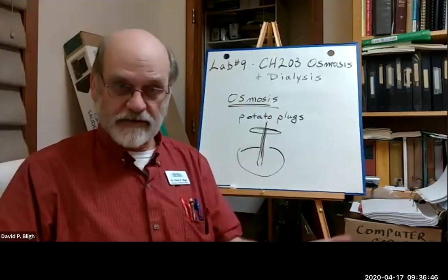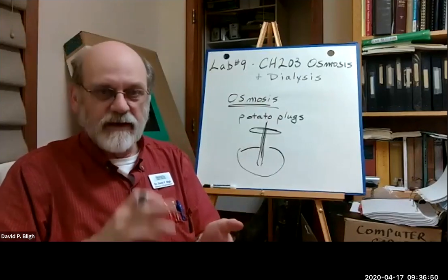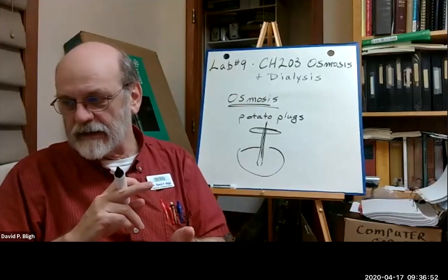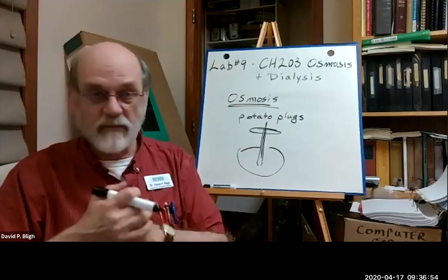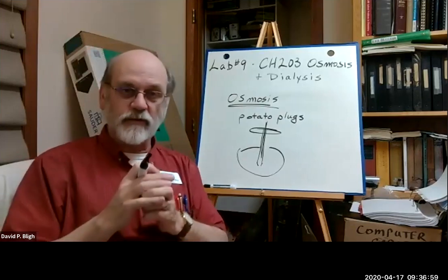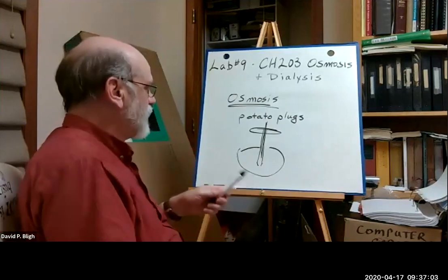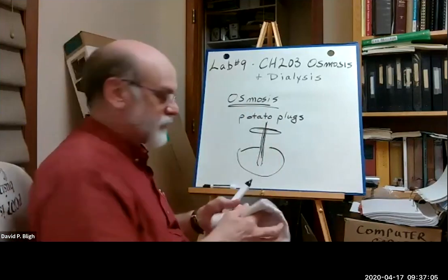And then you take the same types of measurements. Do the mass, do the length, and compare them with the original results, and draw some conclusions. That's what the post-lab questions are about. Okay, so that's how we're going to study osmosis.